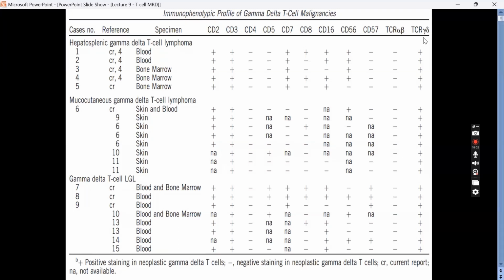No, you need to understand that you can't go with the side scatter much, because I suppose it's been shown in a log scale rather than in linear scale. But still fine, no problem. But see, two things away from TLGL are the lack of CD5 and absence of CD57. This is unusual with TLGL. Actually, 57 in the graph you showed was plus-minus, so I thought it can be negative also. But CD5 is always positive.